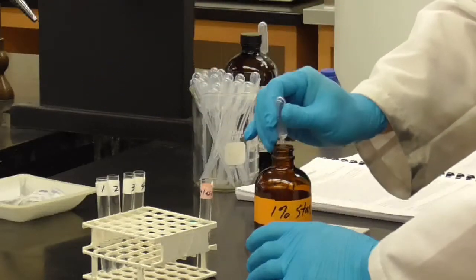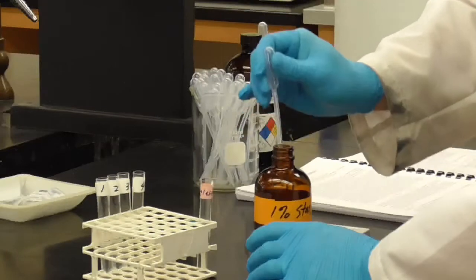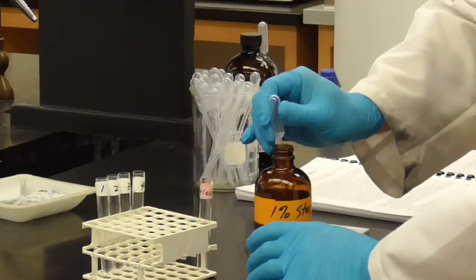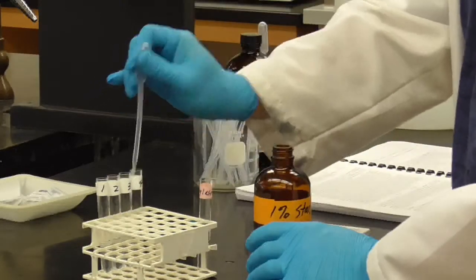That will be good enough, so I'm not taking too great of pains to get these just perfect each time. I'm going to compare them afterwards, and if one's a little low, I'll go ahead and top it off. As long as they're about the same amount in each one, that will be fine.